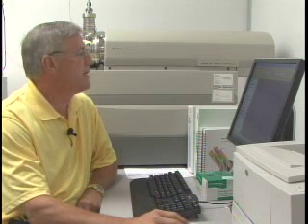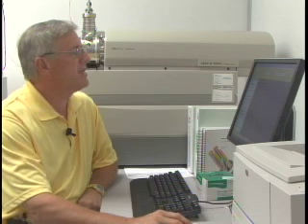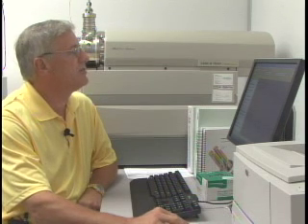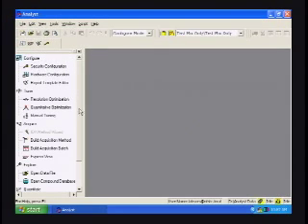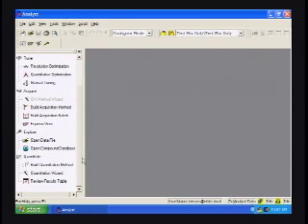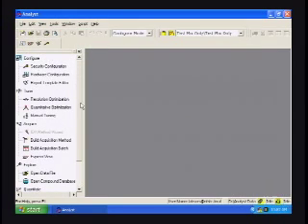Now that we've seen the hardware introduction, let's take a look at the software introduction. Applied Biosystems software is entitled Analyst Software, and here is the main screen for Analyst Software. Across the top there are various toolbars that, as you get into different modes, the toolbars will change as we'll see in just a second. The navigation panel here consists of the headers Configure, Tune, Acquire, Explore, and Quantitate, and we'll get into each one of these briefly in just a second.